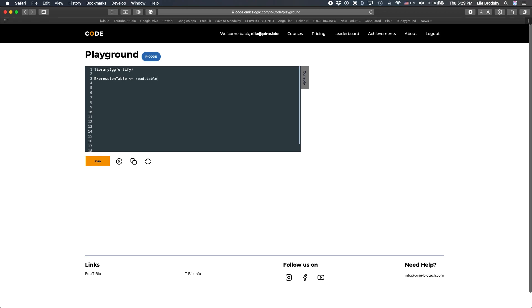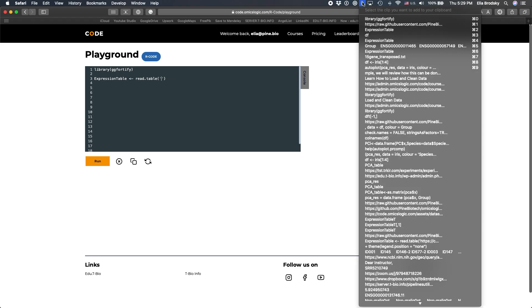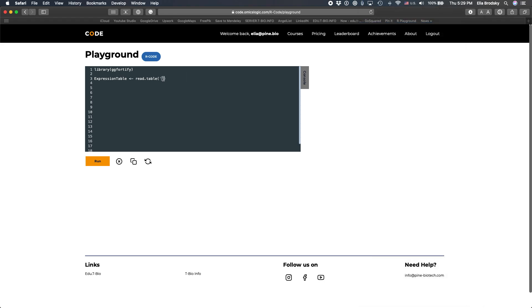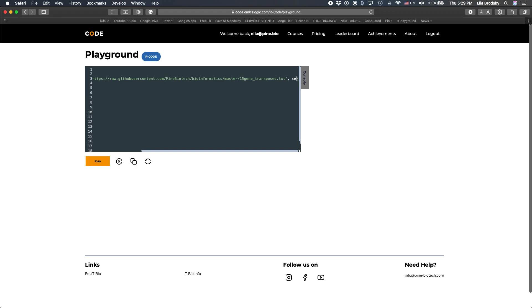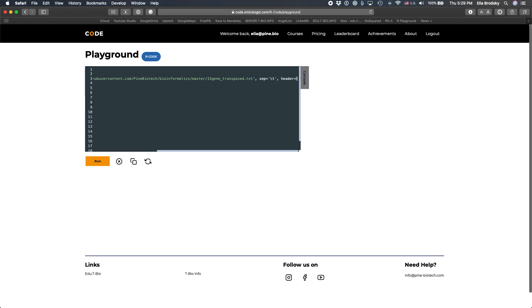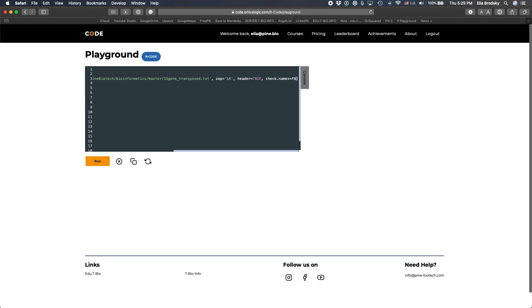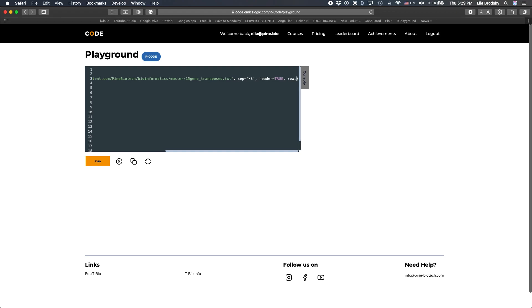We'll use read table and here I already have a link for that file and I'll put this link in the comments. Remember that we need to do sep, which is the separator, is the tab. So it's a tab delimited file. Header equals true. Well, actually, here we don't need to do check names equals false. So we'll do just header true and row names equals one.